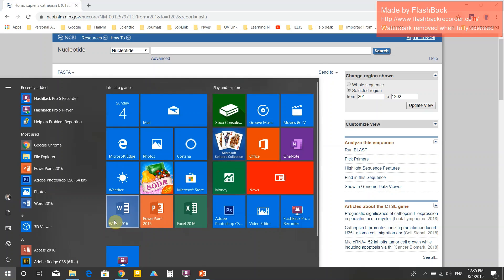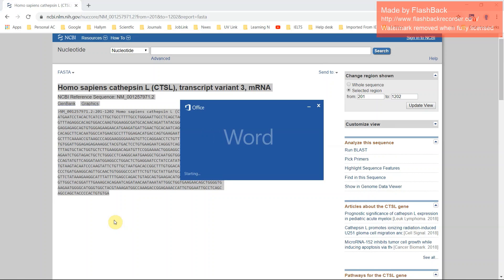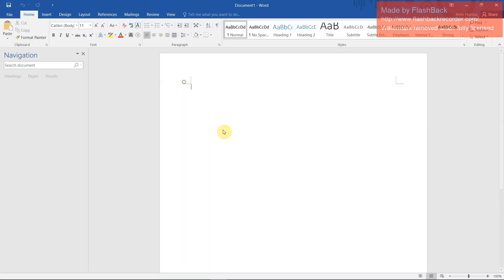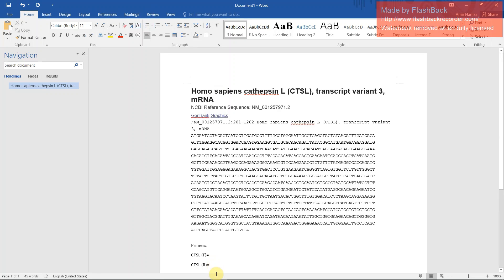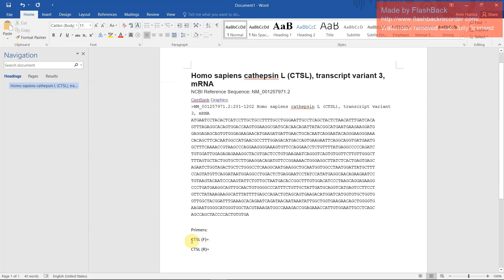Open your Word file, paste here. Now write primers name of your primer, like CTSL F and CTSL R. You will know about this: CTSL F means forward and CTSL R is reverse.